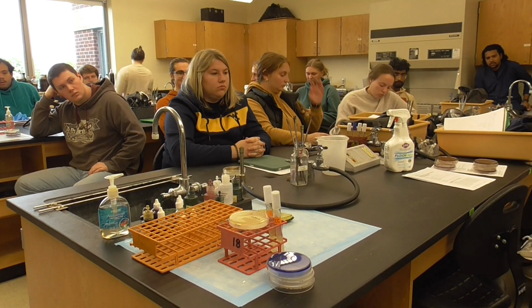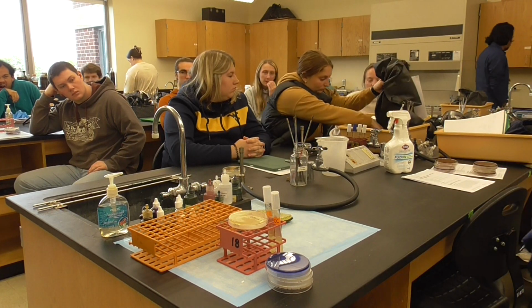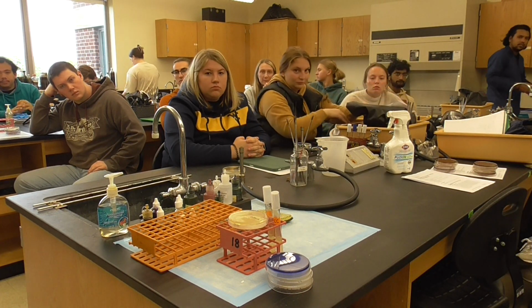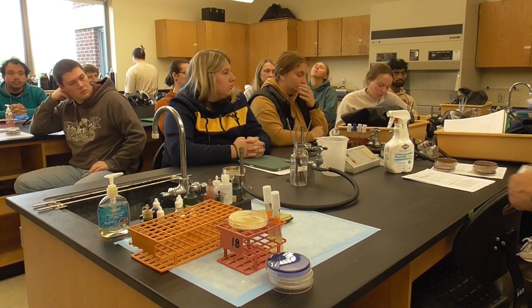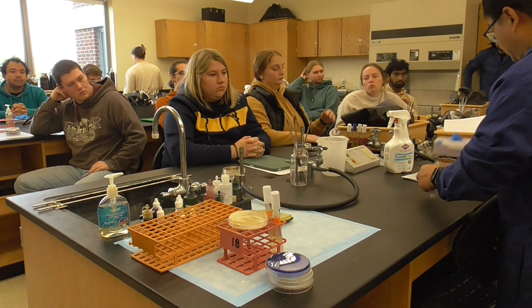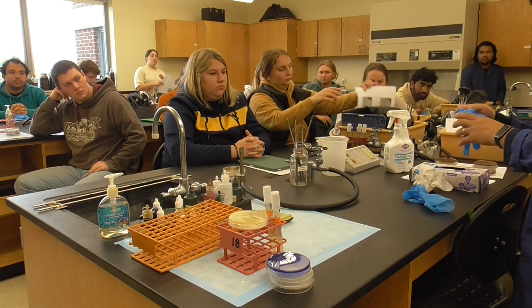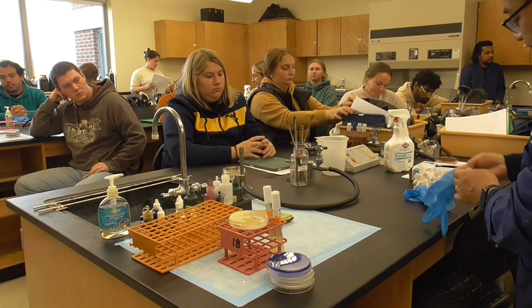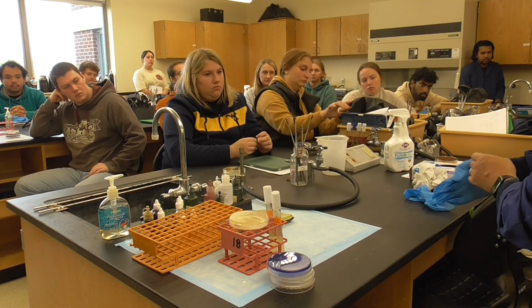Okay, can somebody donate gloves for me? If somebody has gloves. Thank you very much. So again, first things first: clean your bench, wear gloves, and get your 3 plates.